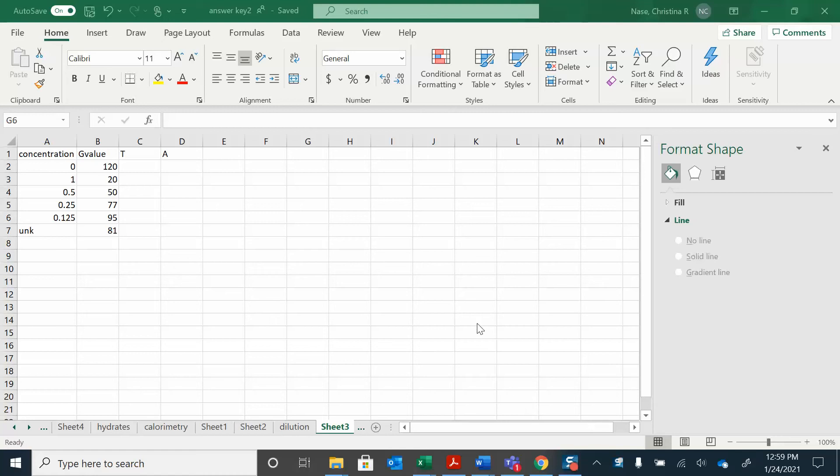How to make the calibration curve for the dilution slab. So I have some sample data here. This is my blank. The 120 is the blank. These are the different concentrations and then those are the G values there.